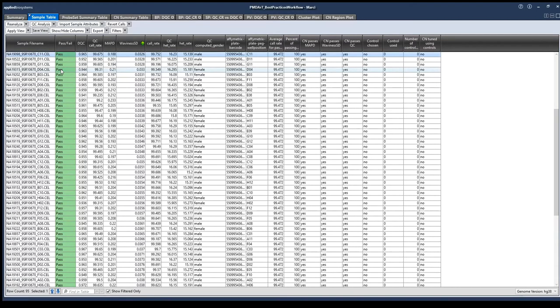On a per-sample basis for the PMD array, we have four different metrics: DQC, QC call rate, MAPD, and waviness SD. DQC and QC call rate are the main metrics used for quality control of genotyping data. DishQC measures the amount of overlap between two homozygous peaks created by non-polymorphic probes. We want DQC values to be above 0.82 for each sample. QC call rate is a percentage of probesets receiving a call, based on a probeset list of autosomal markers — typically around 20,000 probesets — and we want this value to be above 97% per sample.